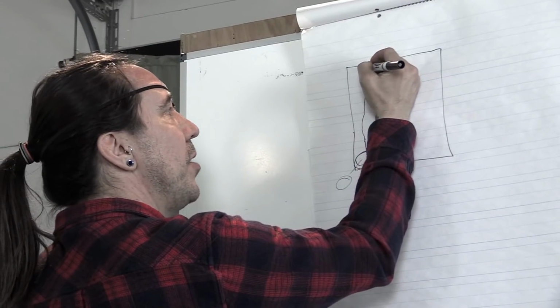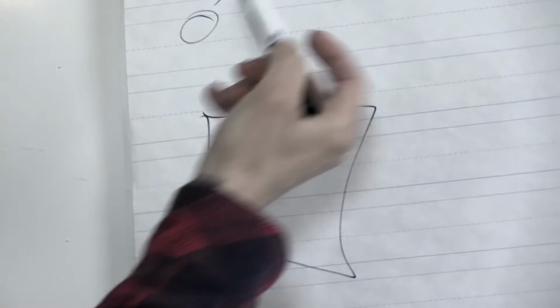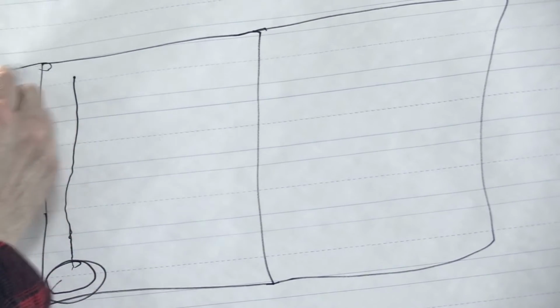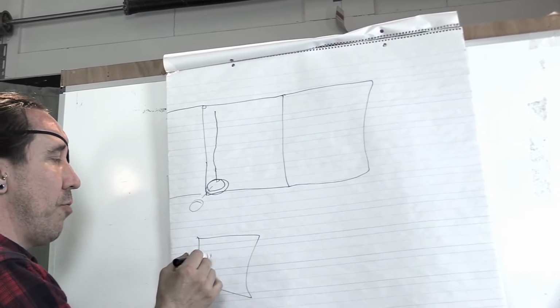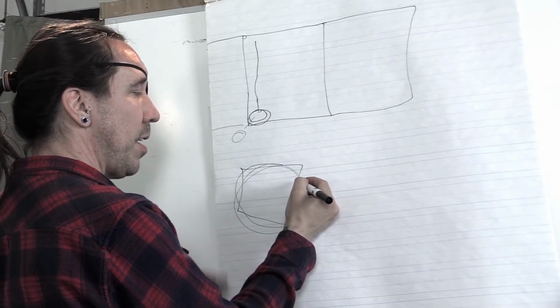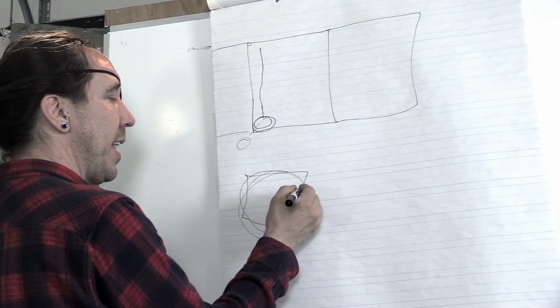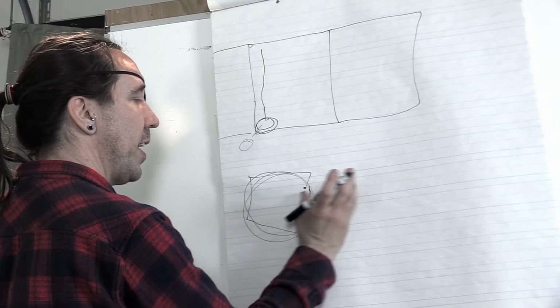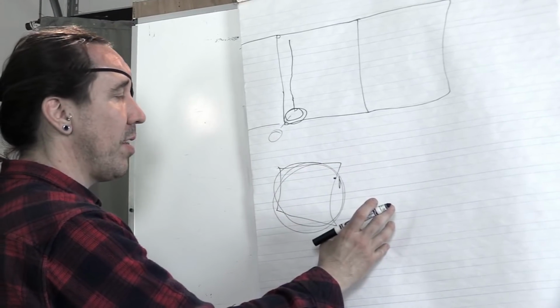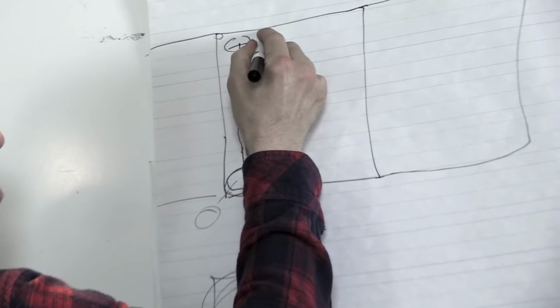So then what I do is, this is going to be confusing. This square is my cover slip on the microscope slide. The square that I'm about to draw represents what you're looking at through the microscope. You want to pick something on your right-hand side, like a little aggregate, and then move your microscope over so that you know you're getting the full width of movement, so then you're not going back over anything you've already seen. So pick a little point of view there, and then move from here over to here.